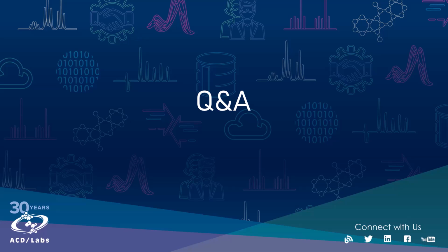Okay. So I see a question here. I understand that your software uses both science-based tools and statistical-based tools. Is this sufficient to address Q14, or do we need other stats packages?